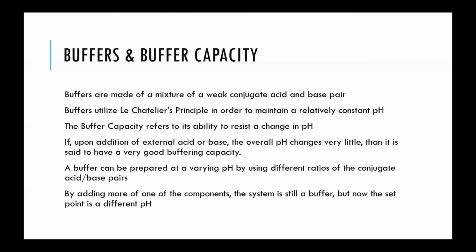So it needs to be buffered or be prepared in a solution that resists any large fluctuations in order to maintain that constant pH. When you have something that's a very good buffer, if you add a little acid or a little base, the overall pH changes very, very little.